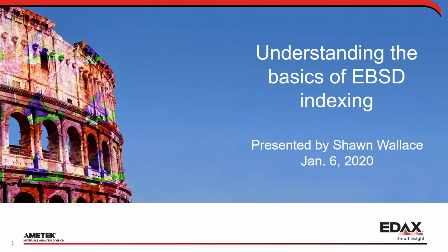So you have to really trust the Hough to find these lines. And sometimes you can be like, is that really a line? I'm not sure I believe it. But as you learn how to trust the Hough and to get the ugly patterns to do a good job, you can collect better data faster.